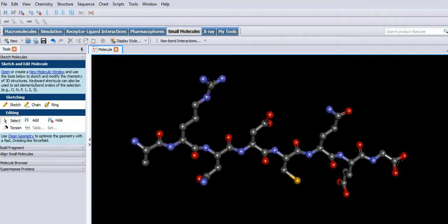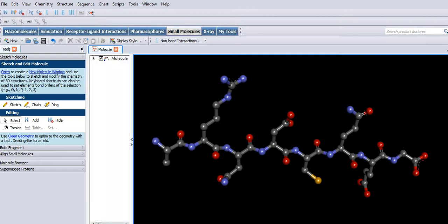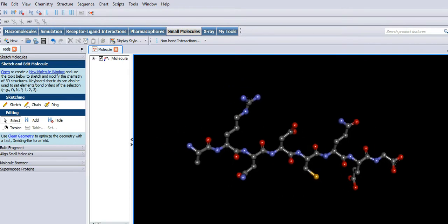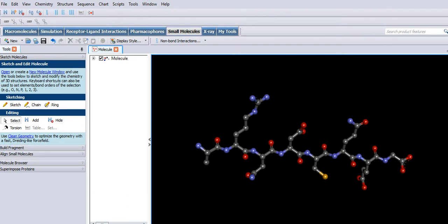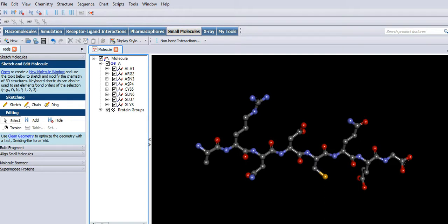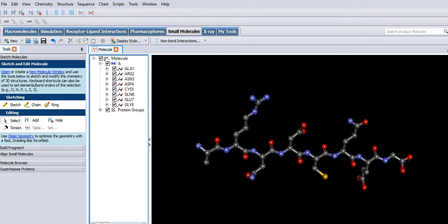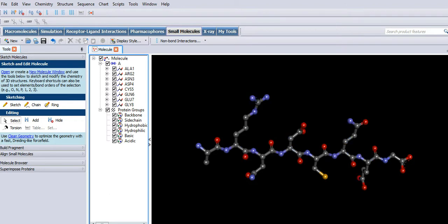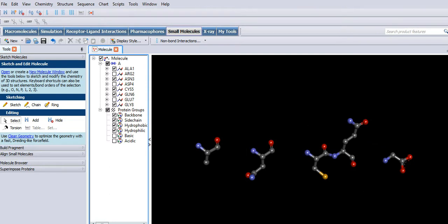Very easy to identify the characteristics of the molecule here. Just zoom out a bit. We've got its own up there. There are the bases. You can identify them very quickly just by making them invisible. Protein groups are very useful. You can spot hydrophilic groups, take them out, basic groups, acidic groups. Very useful.